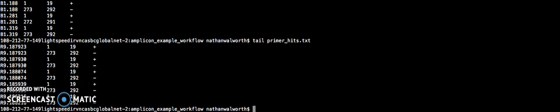We are also going to filter out sequences that seem unusually short or long for what we'd expect. There are no set rules for making these decisions about what's too short or too long, and it's possible you'd be throwing away something interesting. But once again, for the most part, broad level community surveys like this one aren't really designed for finding rarities per se, and it's much more likely really short or long sequences are spurious rather than something legitimate. Here I chose 10% longer and shorter than we'd expect our sequences to be as the limits.